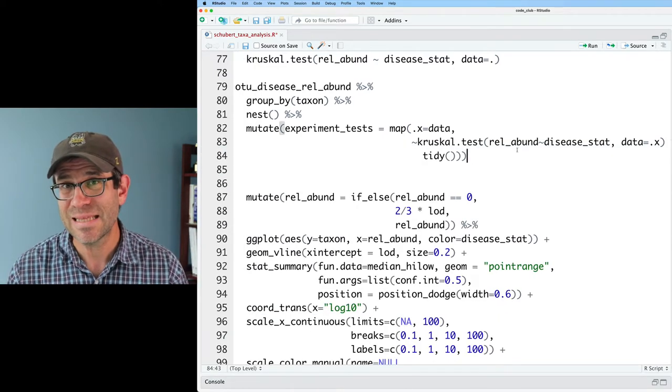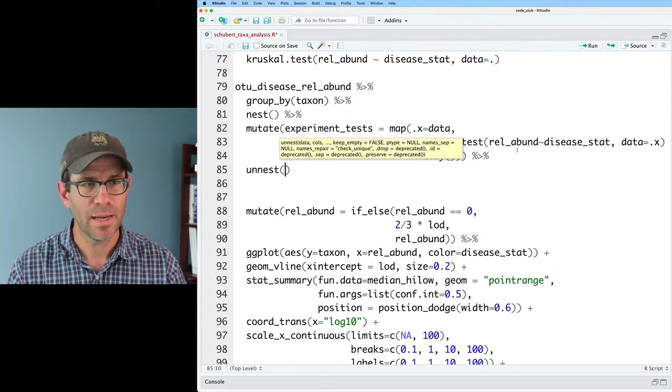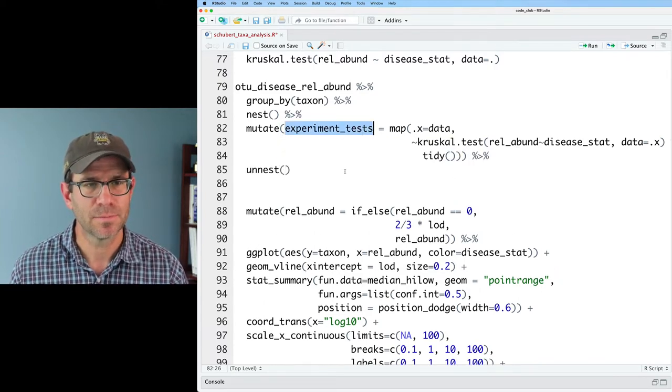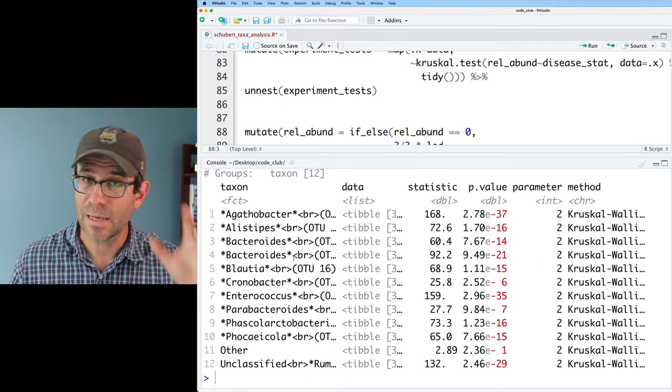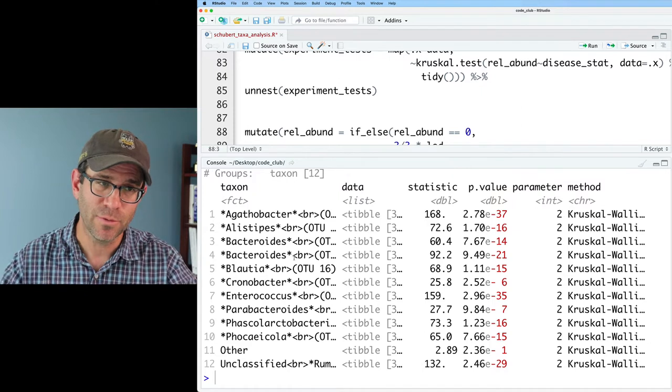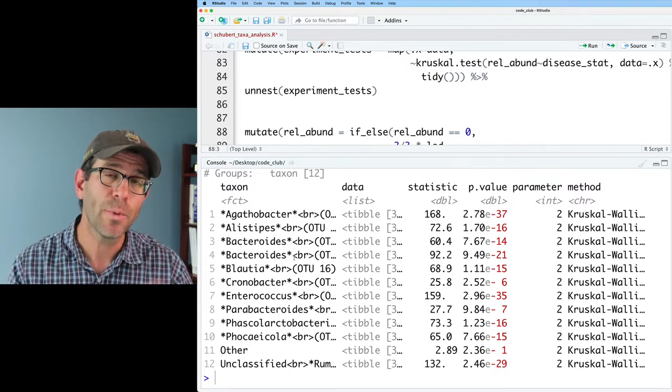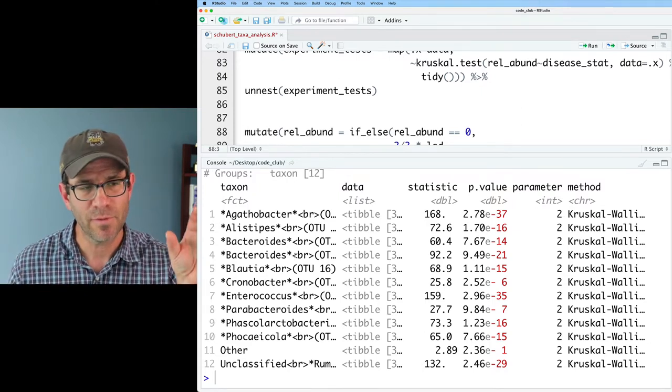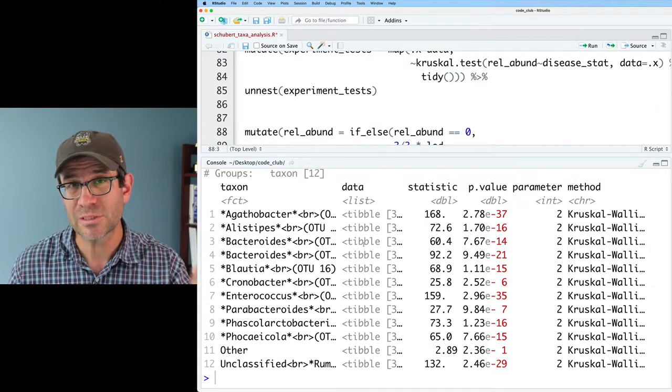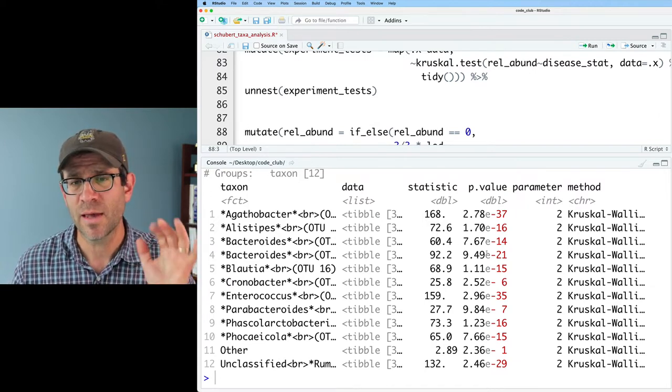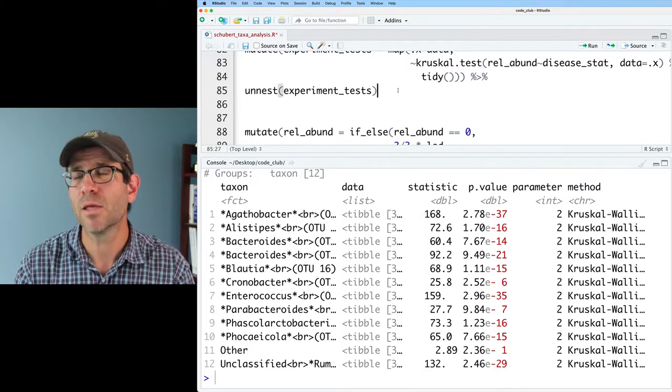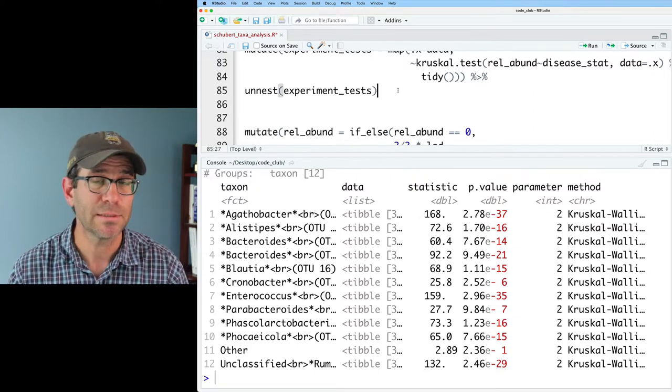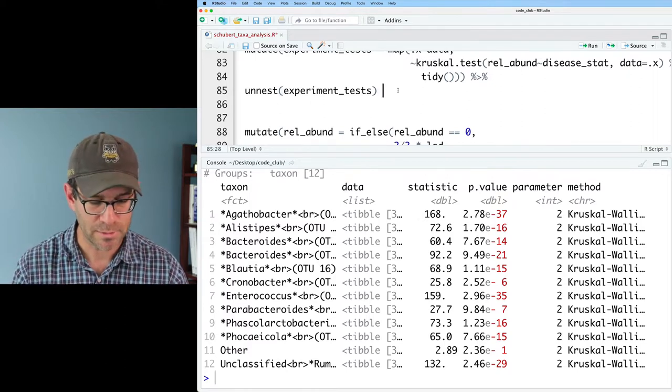Now if I want to see what's in that column, I can pipe this and do unnest experiment tests. So we now get as output from running the Kruskal-Wallis test. Now that we've run unnest, we kind of explode open that column of data frames to see that we've got taxon, the original data that's still nested, our test statistic, the p-value, the parameter, and the method. That p-value is not corrected for multiple comparisons. So we need to go ahead and correct for multiple comparisons.